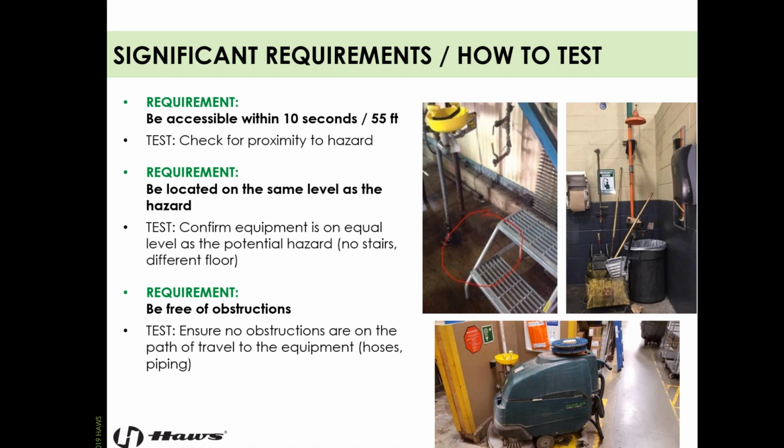All of these pictures on the right-hand side here, these are real. These aren't staged or anything. Emergency equipment gets used, hopefully, so little other than testing. I mean, really, if you have an emergency, you're hopefully going to have the right equipment in place, but ideally, we don't want you to ever have to actually use emergency equipment, right? We want it to sit there and get tested and never get used, but it's got to work right.